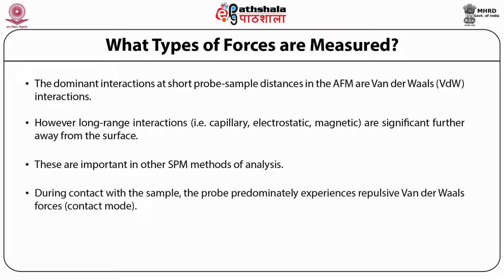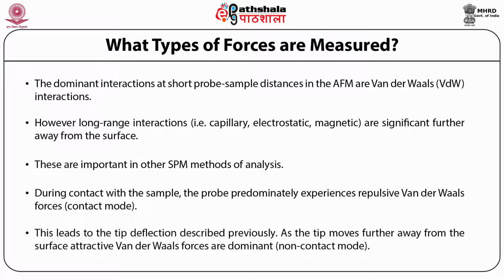During contact with the sample, the probe predominantly experiences repulsive van der Waals forces in contact mode. This leads to the tip deflection described previously. As the tip moves further away from the surface, attractive van der Waals forces dominate in non-contact mode.